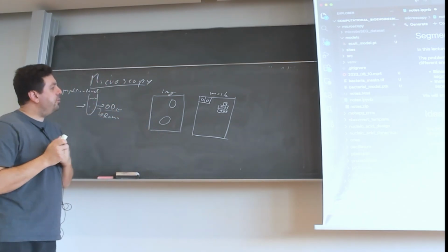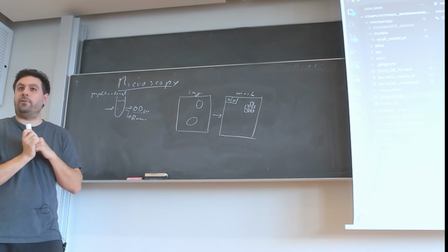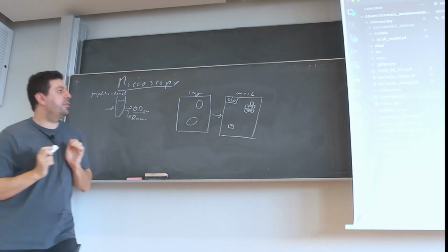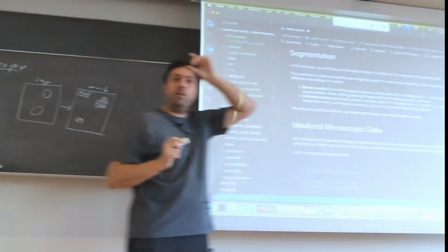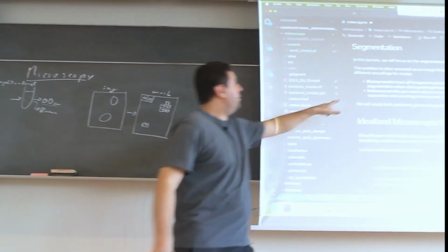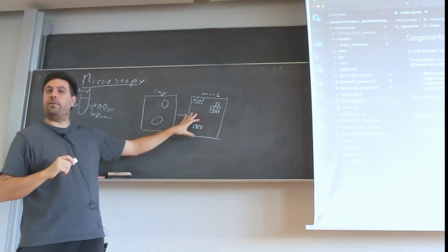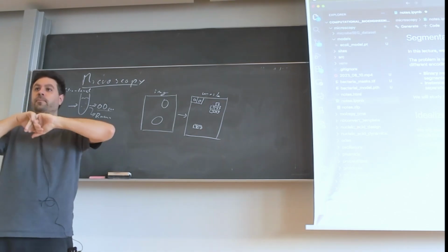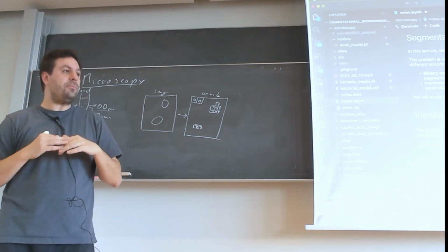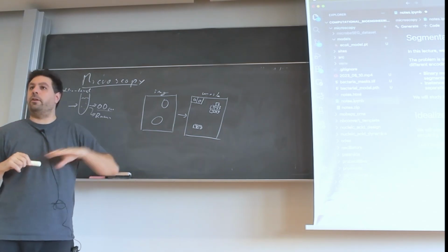There are two subtle points in segmentation. Given the image, you want the mask. You might want for this cell also a 1 if it's what is called a binary mask. It just tells you what is foreground and what is background, or what is an E. coli pixel and what is a background pixel. Or you might have instance masks. We want here to have, for example, a 2, so that we distinguish that this is a different cell than this one. This is particularly interesting if cells are touching. Otherwise, you can say, no problem, all my connected components afterwards just get a post-treatment and get new labels. But this is already difficult if they're touching, which they will be in this lecture.